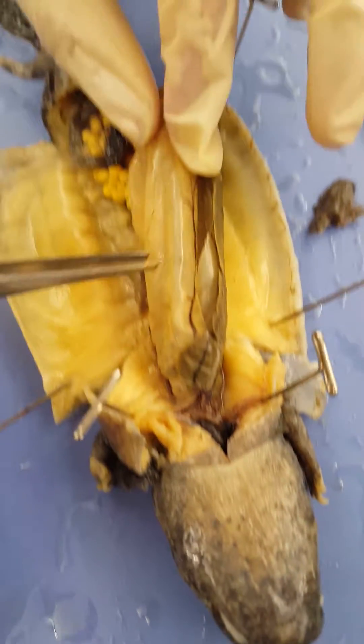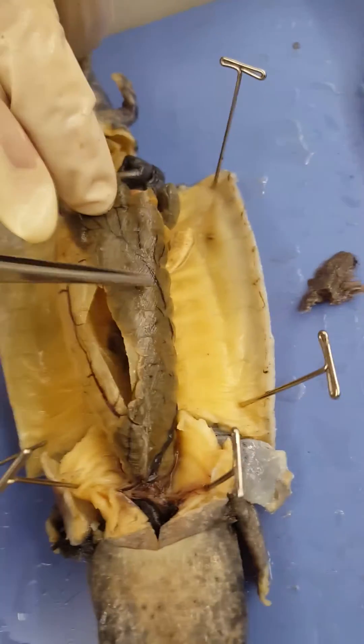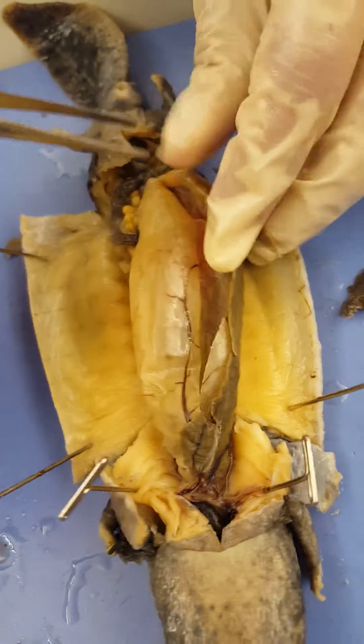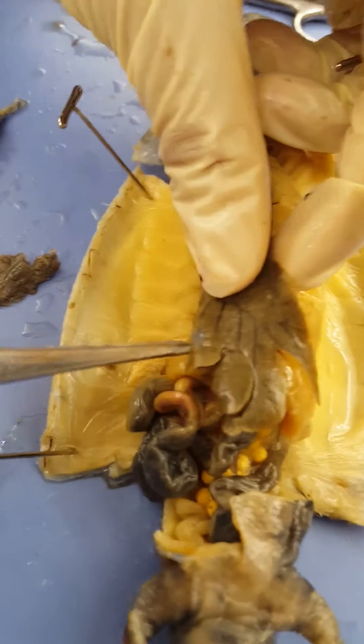This is the stomach of the salamander — this large thing right here. Attached to the stomach is the liver. This is the duodenum of the stomach. Attached to the liver here is the gallbladder.